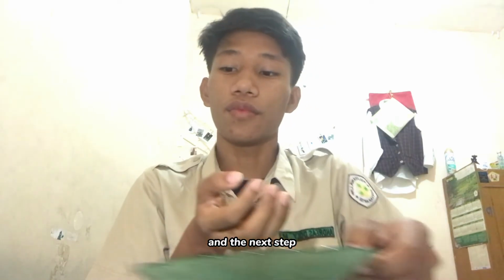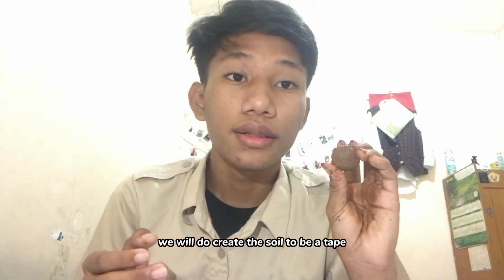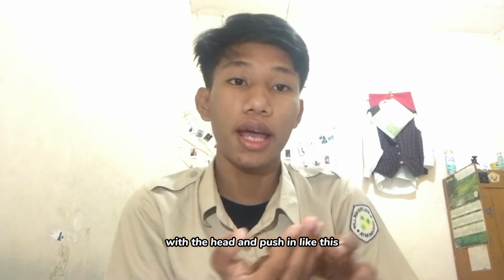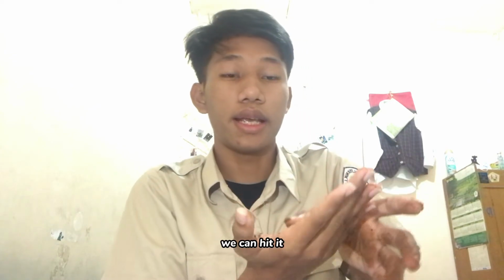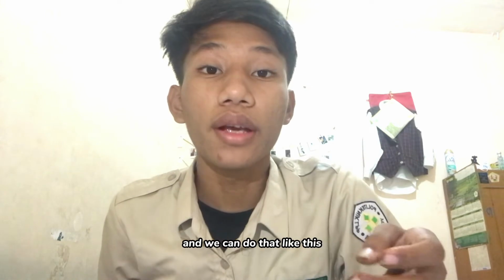And the next step we will do, create the soil into a tape with the hand and push it like this. We can hit and put it, and we can do that like this.